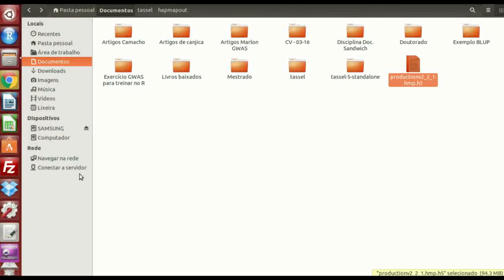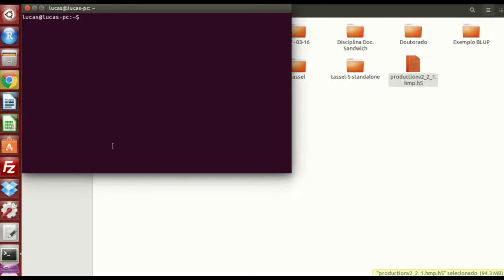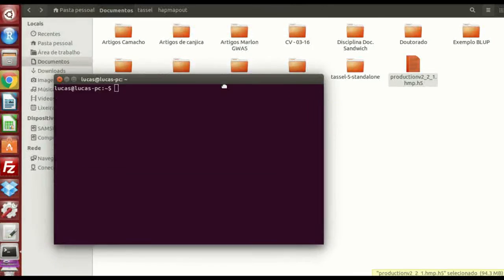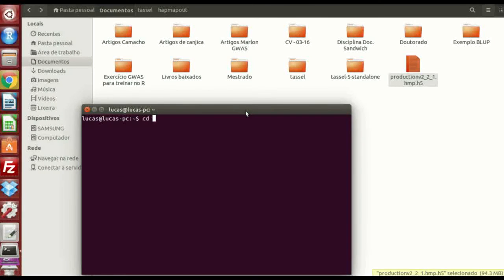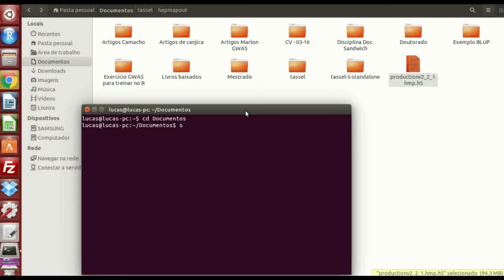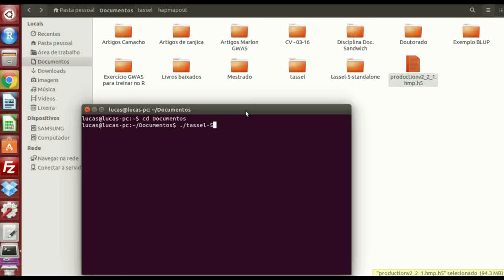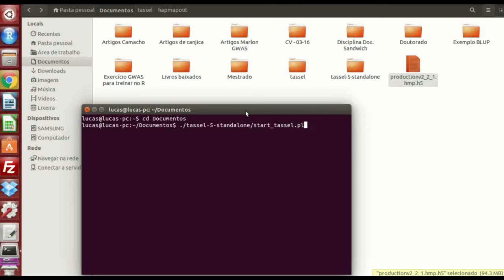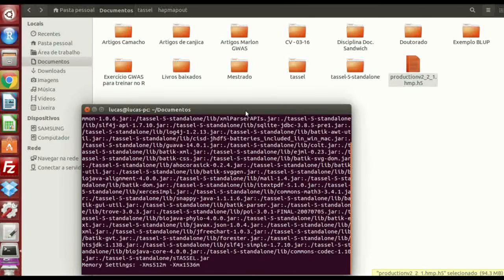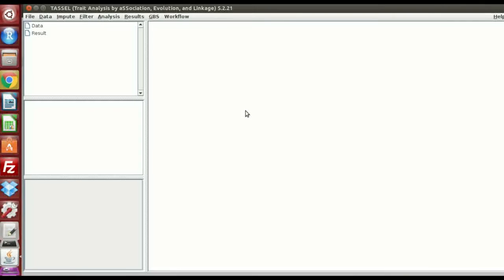I have an example here. The production. So I'm going to open the terminal again. Here in the terminal, I'm going to change the directory. And I'm going to put the command tassel5. Start tassel.flow. So it's going to open the interface. That's great. Here you have the tassel.